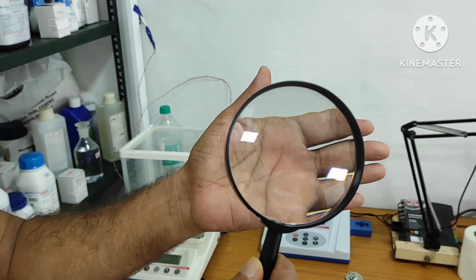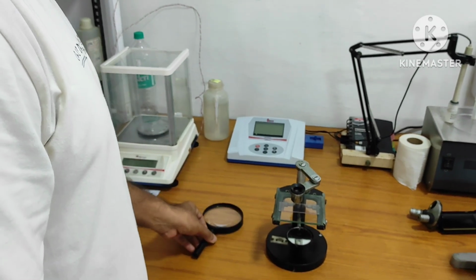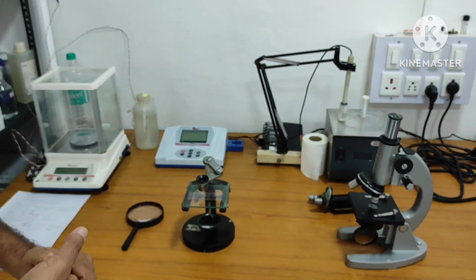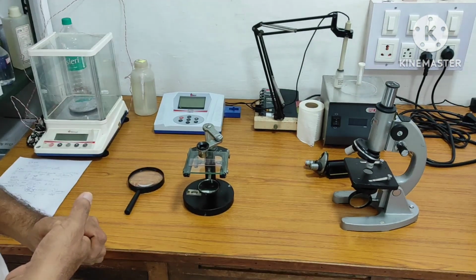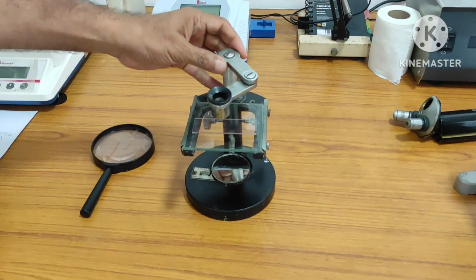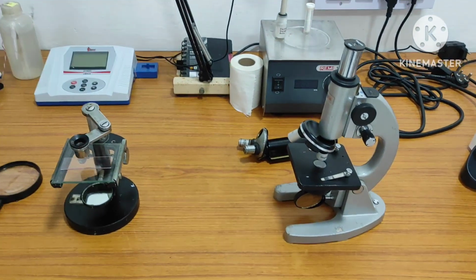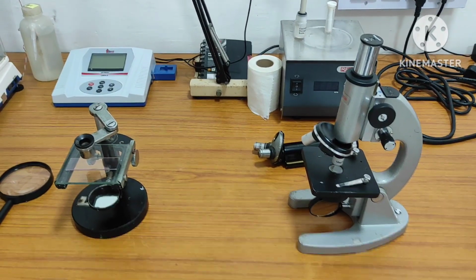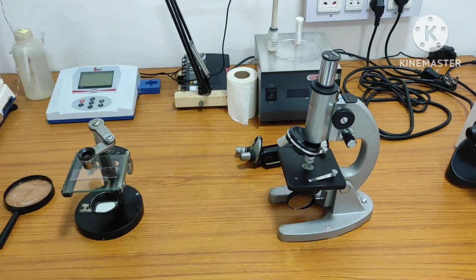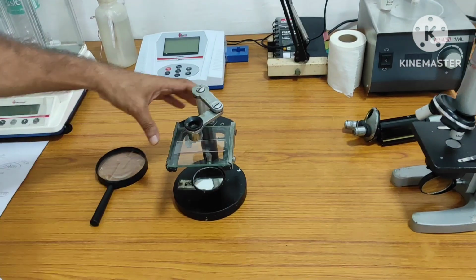I'll explain later what magnification is in microscopy. So it is part of optical instruments. Optics means where light is useful, where we can observe something by use of light, and where lenses are involved. There are various types of microscopes: simple microscopes and compound microscopes. Various types of compound microscopes are also there, like phase contrast microscopy and fluorescence microscopy. We will discuss all these one by one, but the journey of microscopy started with the simple type of microscope.